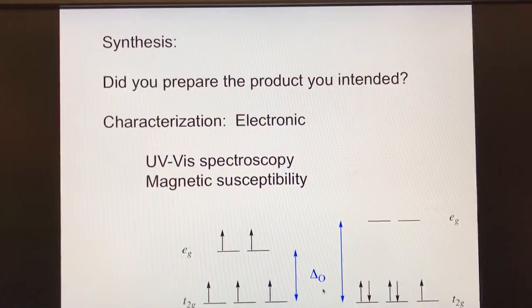So these are the things that you're going to want to be thinking about, not necessarily in the nitty-gritty of your synthesis, but as you do begin to do your characterization of these compounds. Now, the synthetic products are the Cobalt-3 complexes, but we want you to think about things like delta and how the oxidation state of cobalt will affect delta.